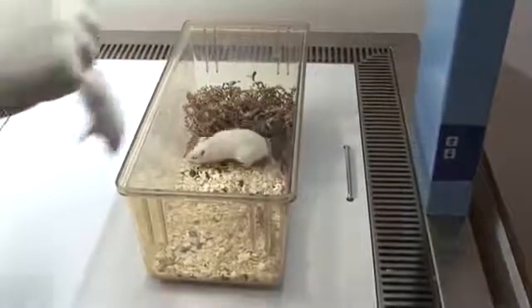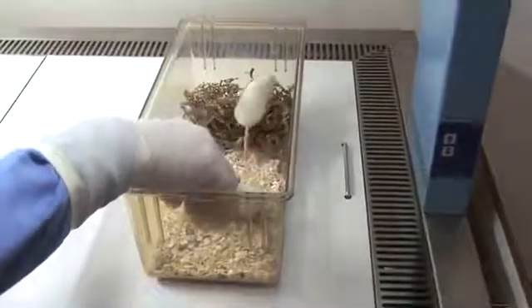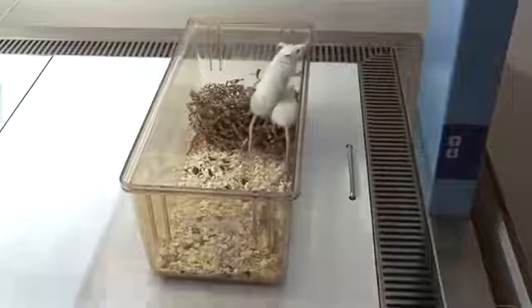When releasing the mouse, maintain a secure grip until its feet have made contact with the cage floor, then gently release it.